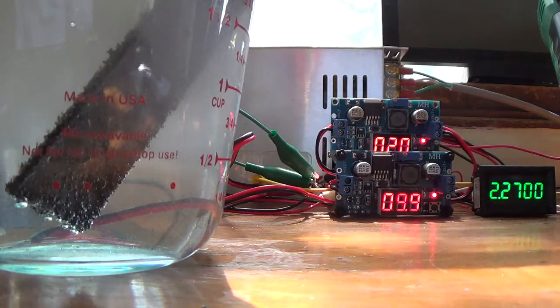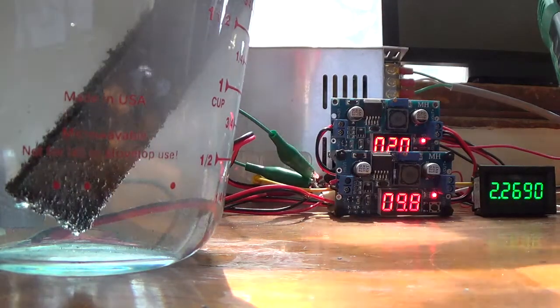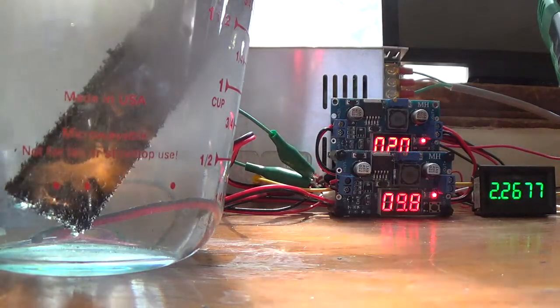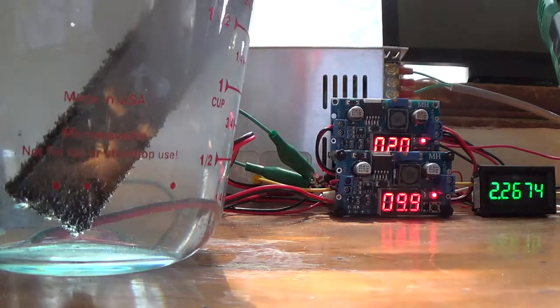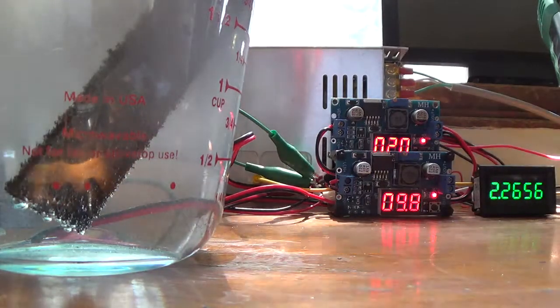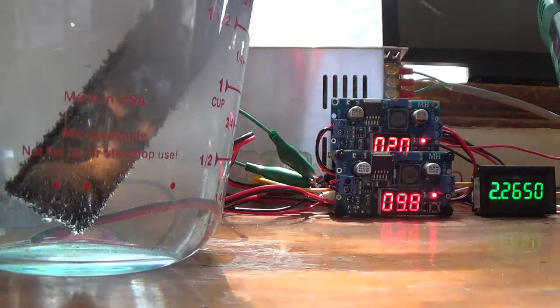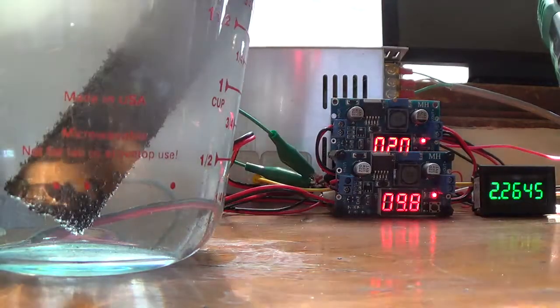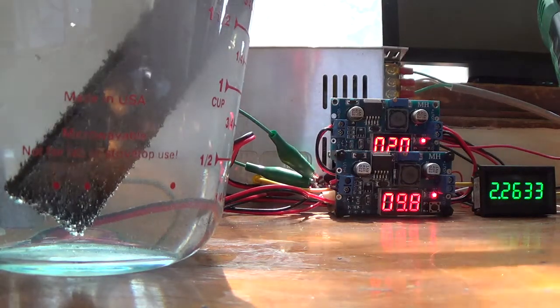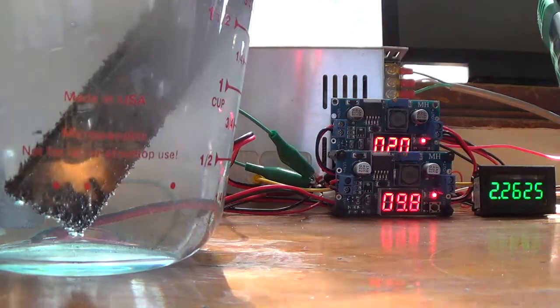The previous sample showed particles of graphite, where literally the piece of graphite was blown clear of the electrode itself before it had a chance to intercalate and exfoliate. So while the experiment itself was a success, the resulting material was not usable. In fact, there's one particular piece that is probably a centimeter square by about 25 to 30 mils in thickness of graphite. And that quite literally got torn apart and blown clear before it had a chance to exfoliate. This seems to be producing a much, much better result.